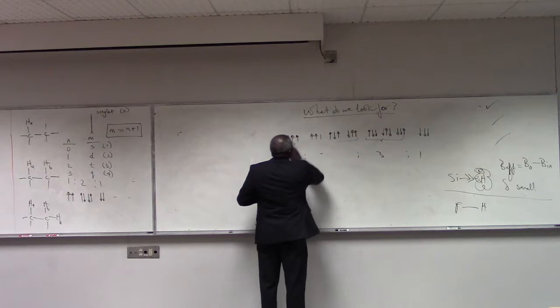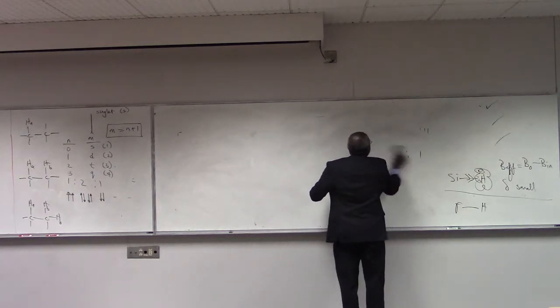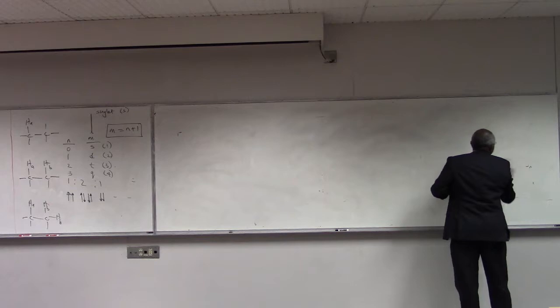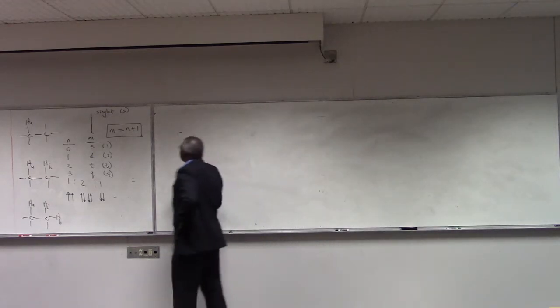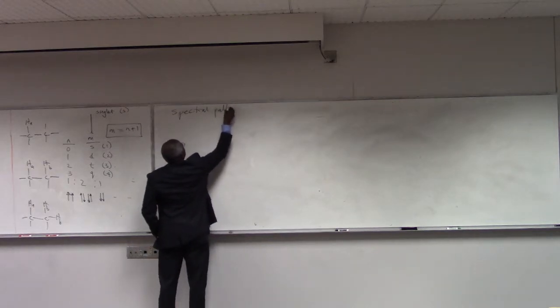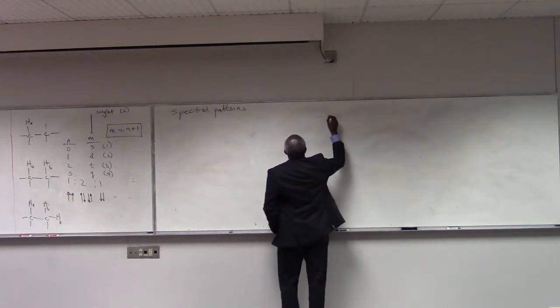So spectral patterns and chemical shifts. And the next thing after this would be analyzing spectra.